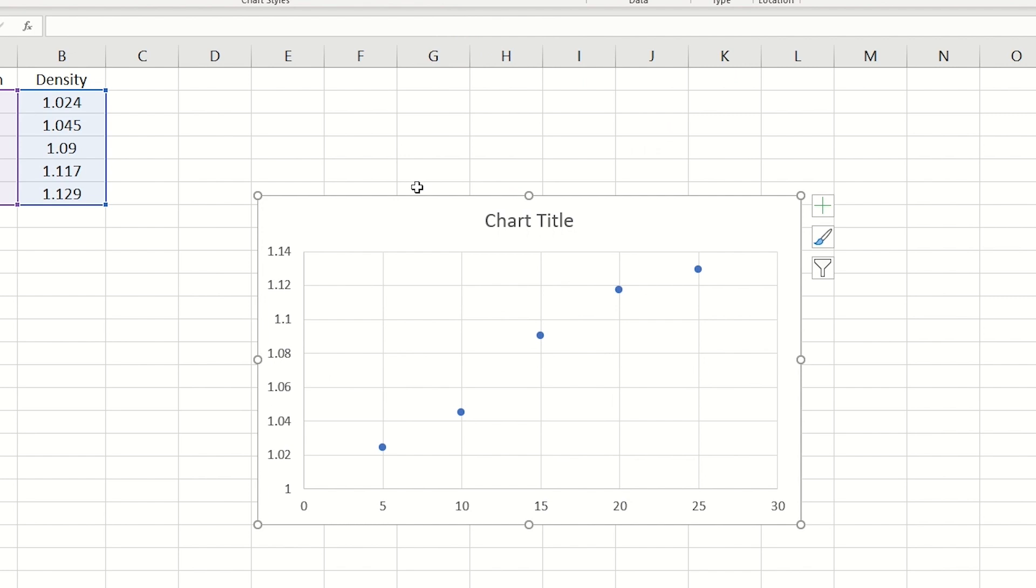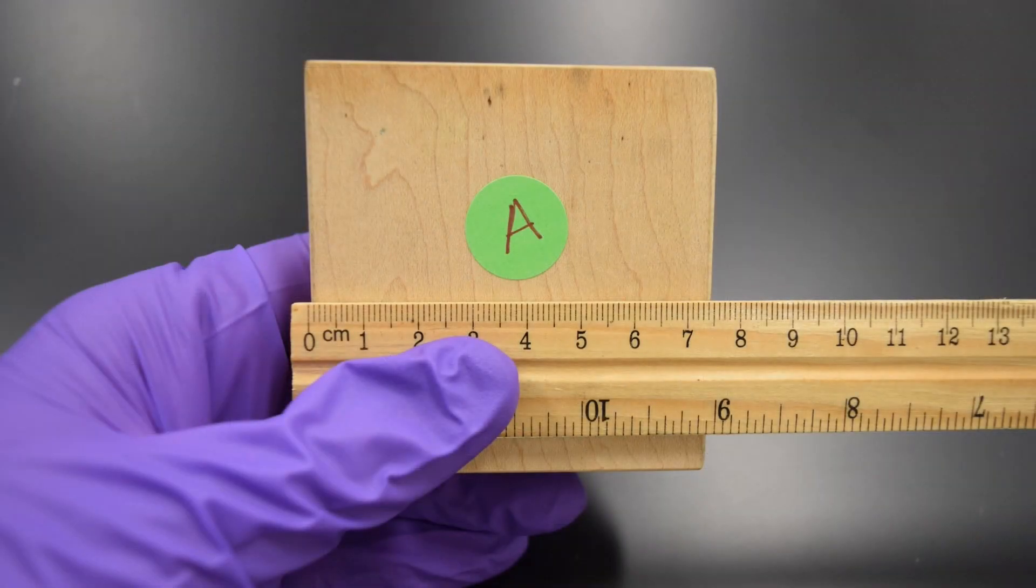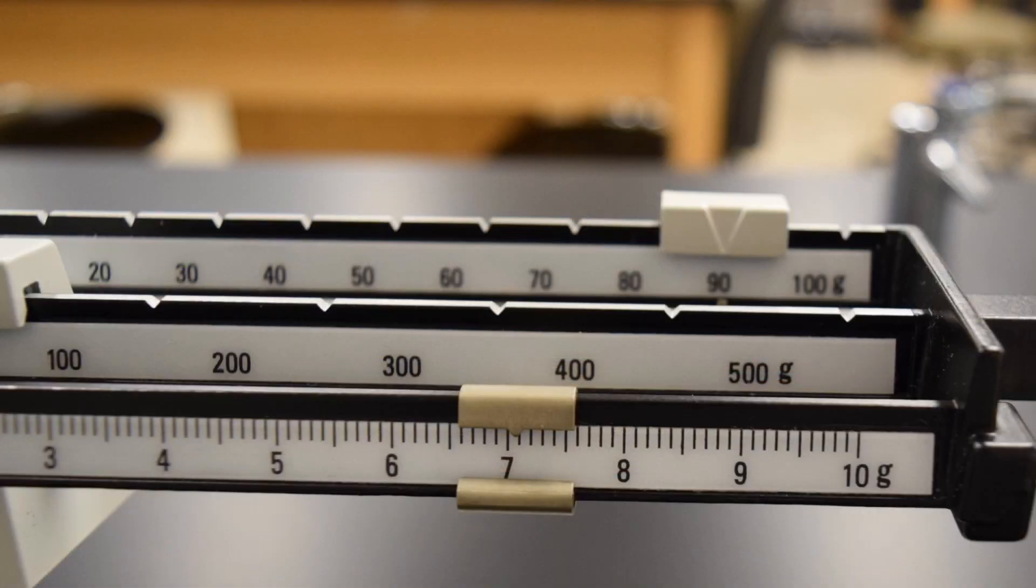Let's begin by finding the densities of solids. Our regularly shaped solid is a wooden block. I'll measure the mass on a triple beam balance. Be sure to refer to the video on mass determinations to review how to read the triple beam balance. I'll record the mass to two decimal places.